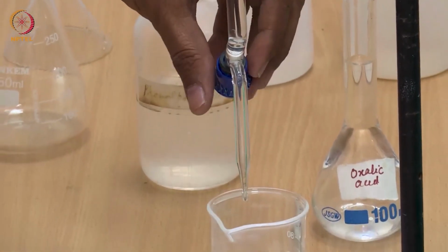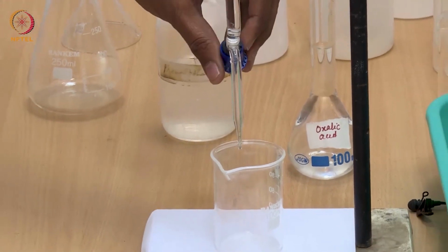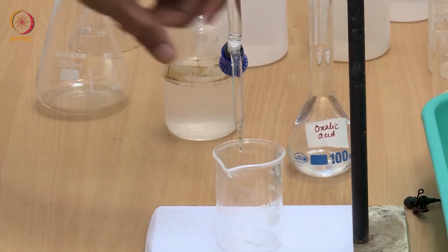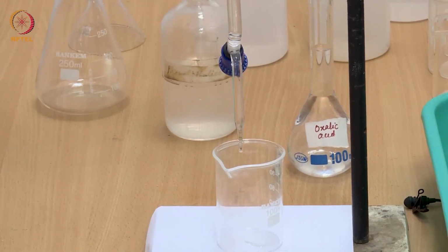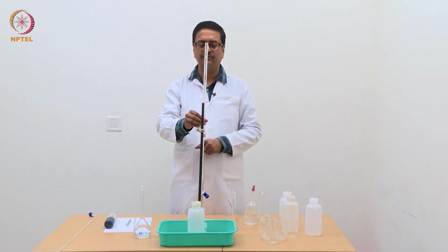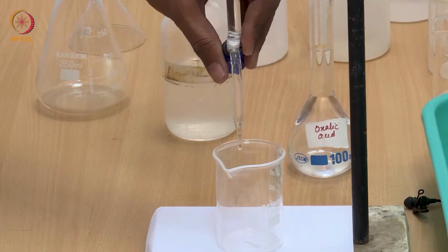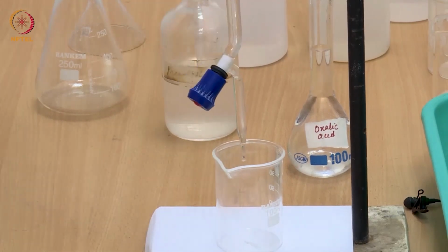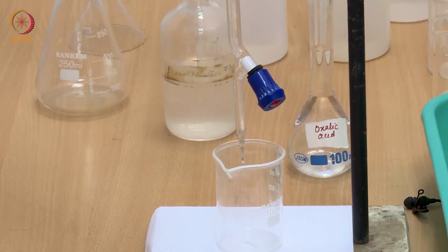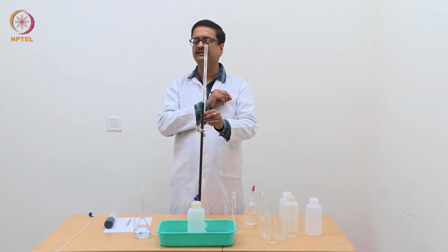So we need to open the stopcock carefully to let the solution flow through and flow fast enough to fill that air gap completely. When the air gap is removed, there is a continuous flow of NaOH from the burette. Then we need to empty the burette only up to the point when you see a 0 mark at the top.